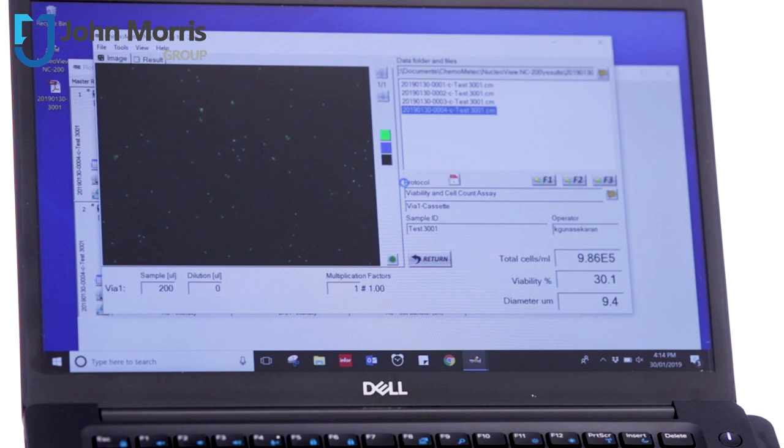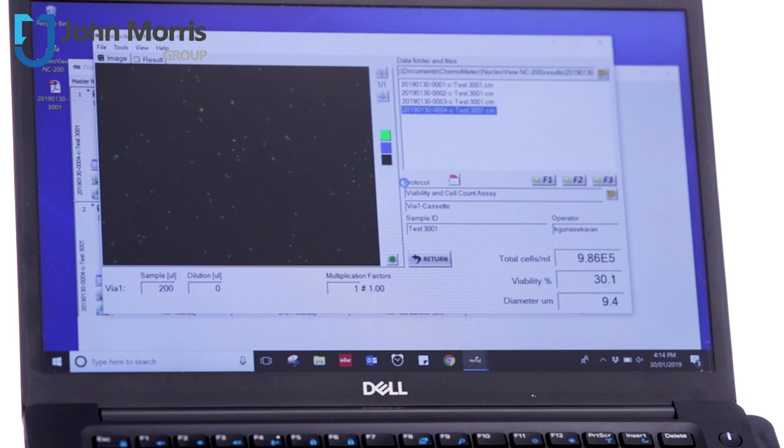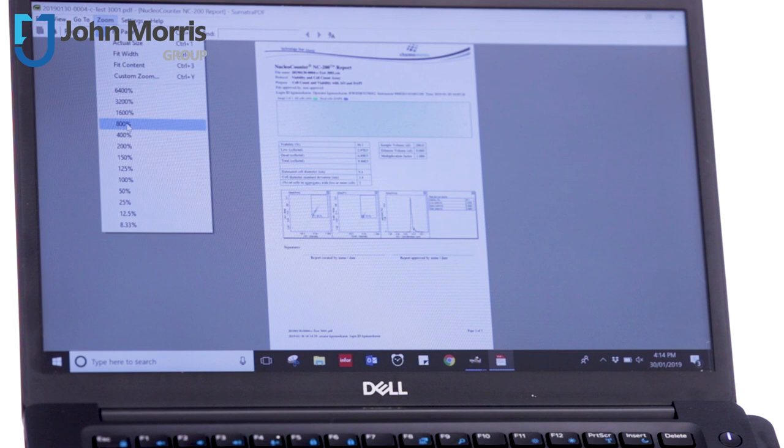It'll create the report for us. And here we go. I'll zoom in on that to give you a little bit of an idea exactly what that kind of looks like.